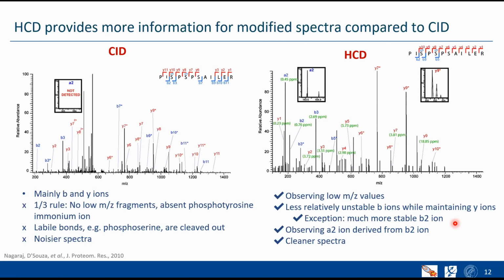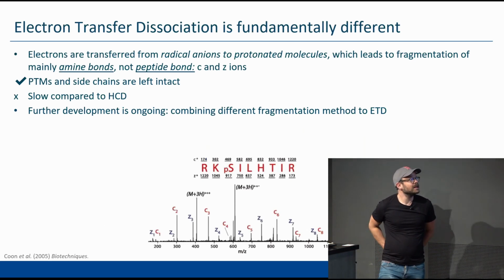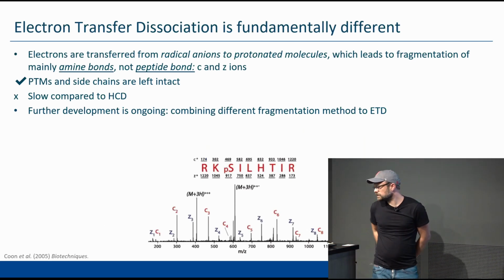resolved better because in CID there is a weird effect which is called the 1/3 rule, which somehow does not allow to actually see the diagnostic peaks. The ETD world is a bit different.